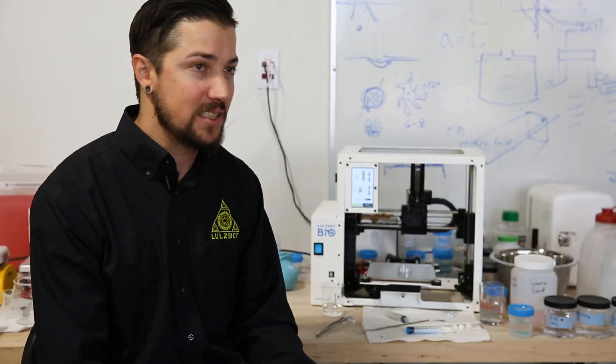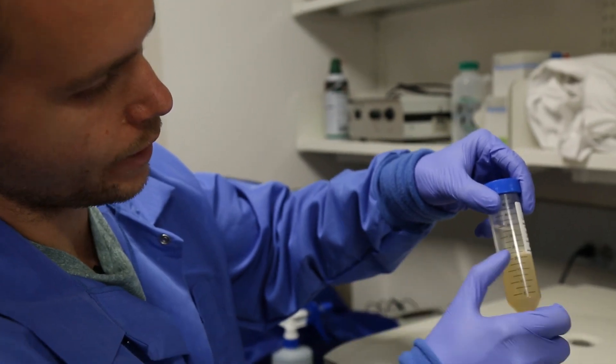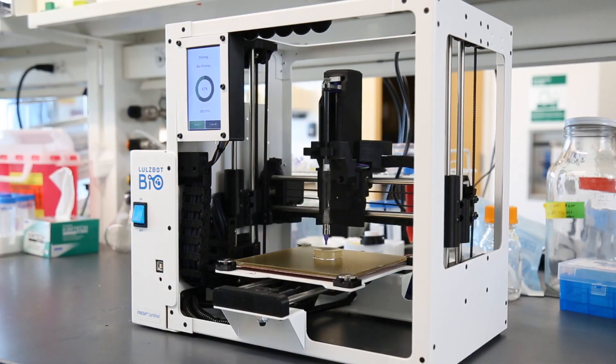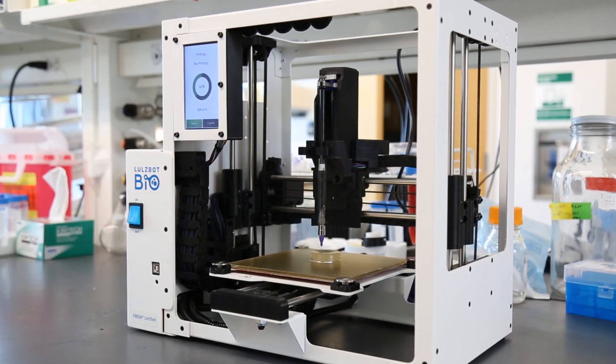You never know what you're going to be printing with six months from now let alone a year. The LulzBot bio features an open material system that allows you to configure the software and the hardware for new materials and processes.